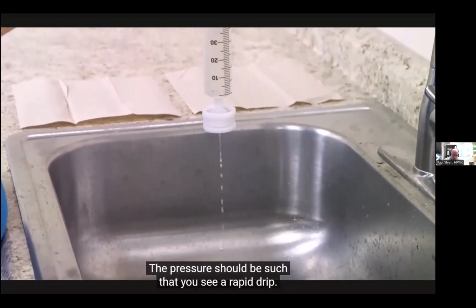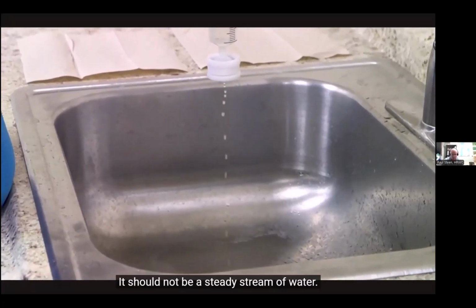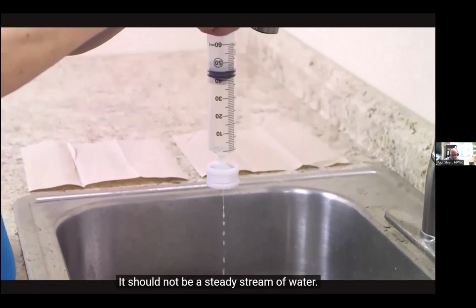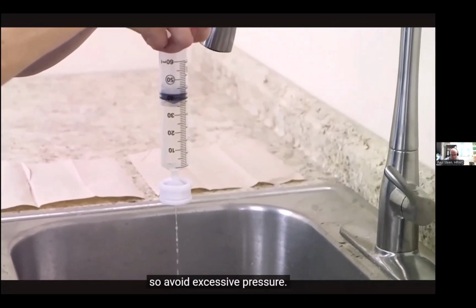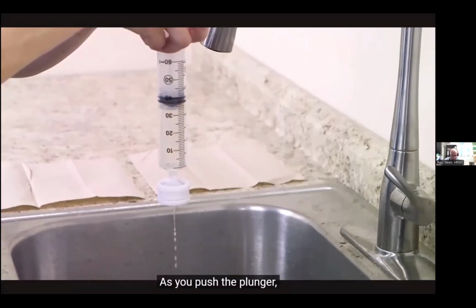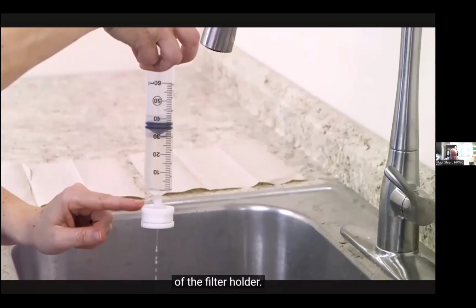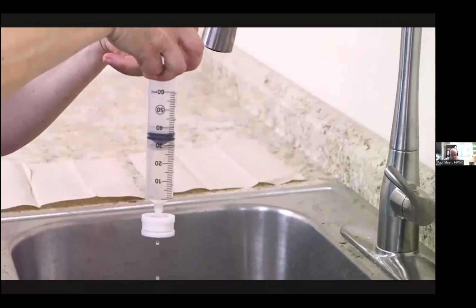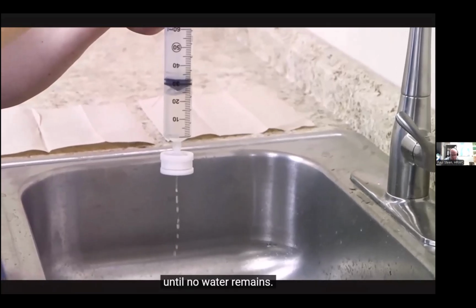The pressure should be such that you see a rapid drip. It should not be a steady stream of water. Pushing too hard may rip the filter, so avoid excessive pressure. As you push the plunger, make sure that no water is leaking out of the side of the filter holder. If you can, you should push the plunger until no water remains.